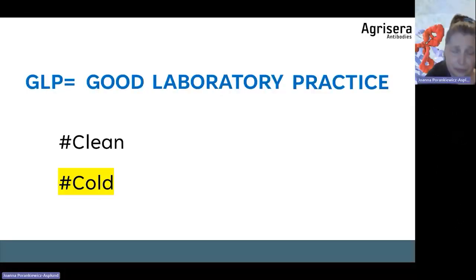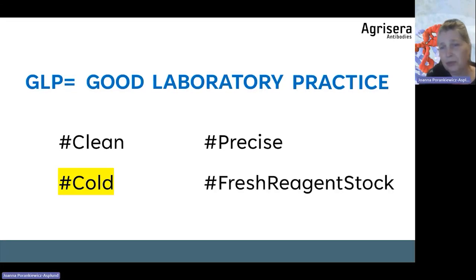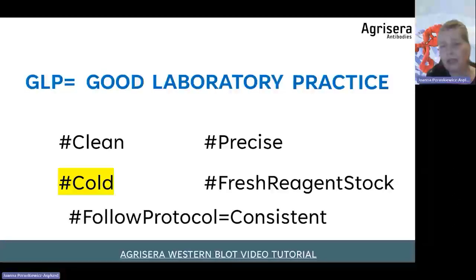Also, working in the cold is very important in the case of Western blot. We have calibrated pipettes and we use fresh reagent stock. This will all help us to get consistent results, and we need to follow the protocol.